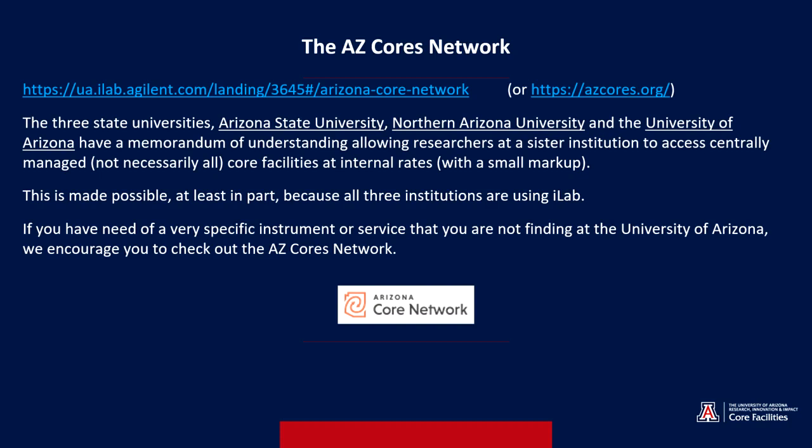The three state universities are all on iLab, and they've come to an agreement that certain centrally managed core facilities, and unfortunately it's not all of them, will be accessible to people from the other institutions at internal rates. Let us help you figure this out, because microscopy has some very specialized techniques. Not all of them are easy to do, and just grabbing some name off of a website at ASU or NAU and driving all the way there only to discover that it really didn't do what you needed to do will certainly be frustrating. So that's what we're here for, is to help you out.